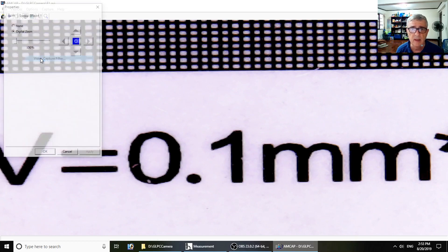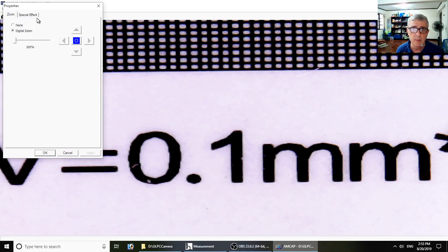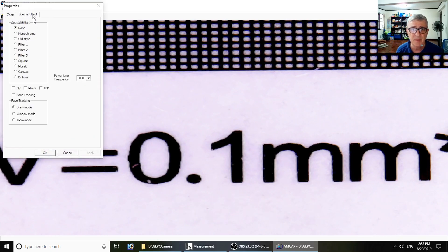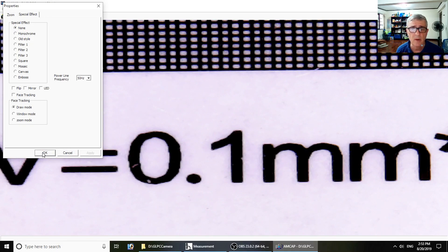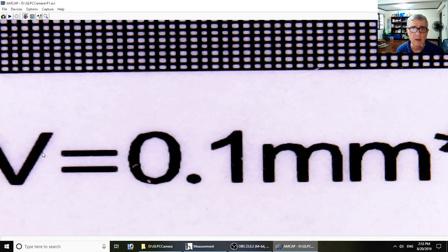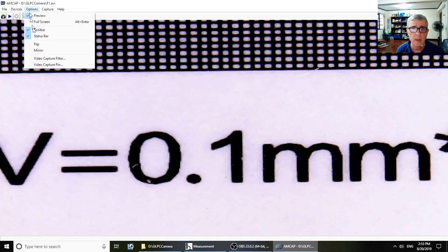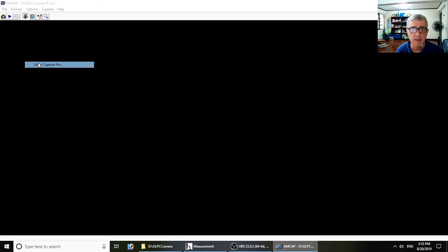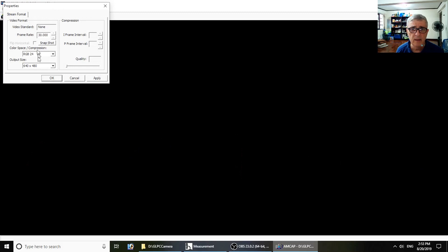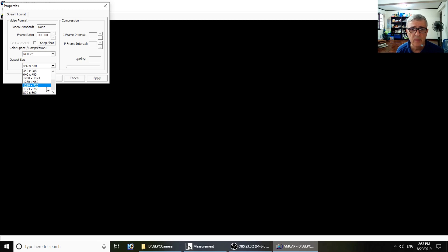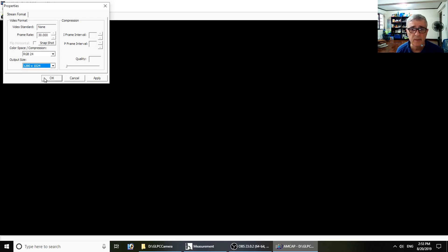Video capture filter - I can't really see using that much with a microscope, but okay, it's there. And then the properties - here's one annoyance: it forces you to reset the image quality every time. I don't love that, but okay.